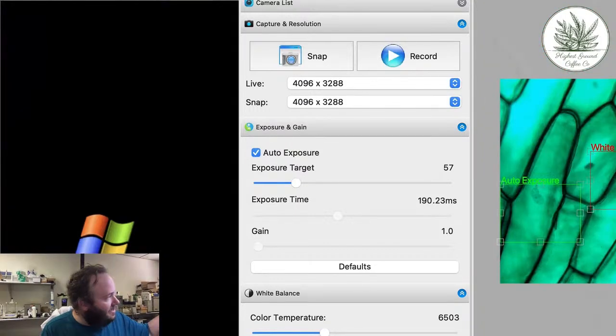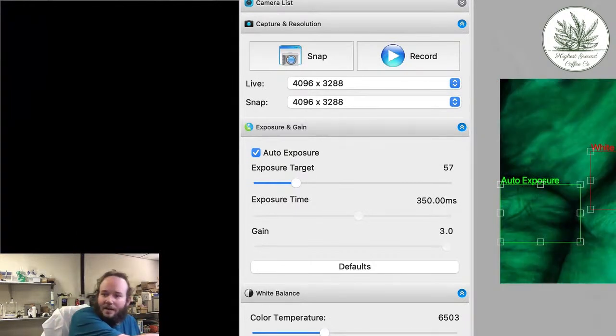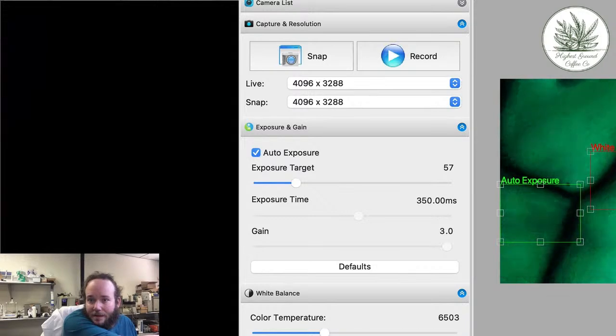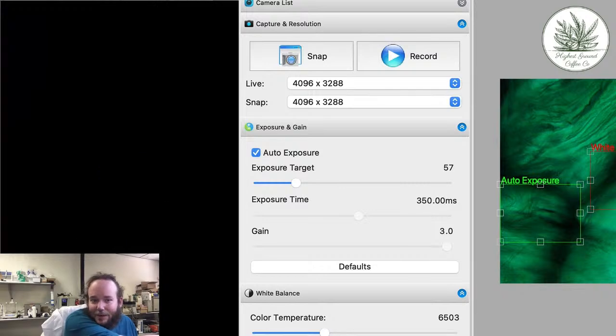Let's go to 60. Oh wow. That's interesting. I wonder what those are. Any guesses what those lines are? Maybe that's just cellular walls being built, like 3D printed on top of one another.